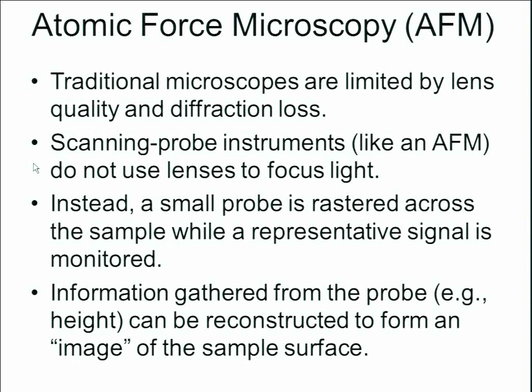Traditional microscopes are limited by lens quality and diffraction loss. And this is true for a magnifying glass. This is true for optical microscopes. It's true for SEMs and field emission scanning electron microscopes as well.